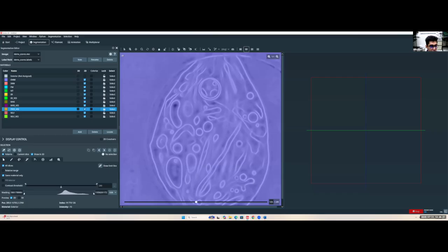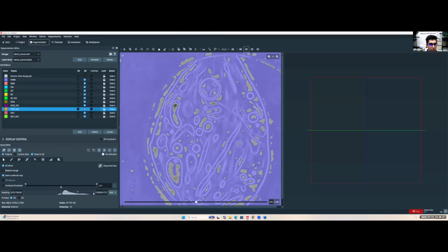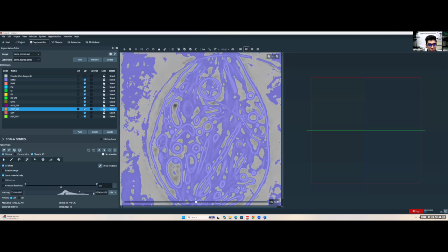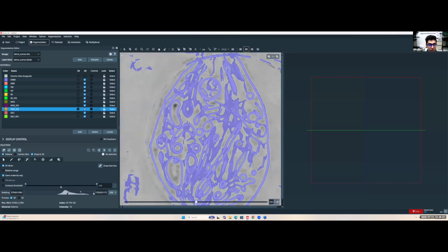So what I want to do is hold down with my left button on this domain restrictor, and drag this to the right through the histogram. And what you'll see is as we approach this histogram and start to move through, the background classes start to open up and it starts to leave only the signal segmented.